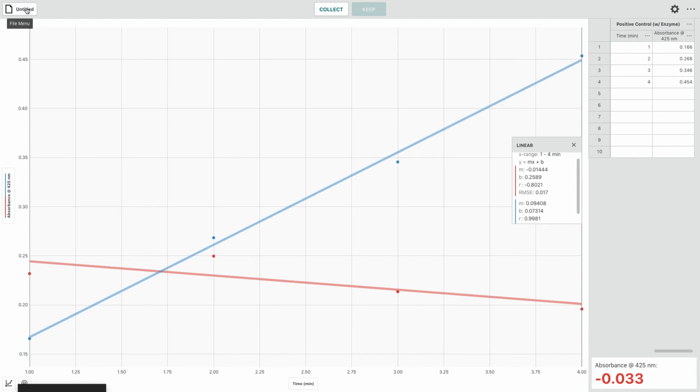But as always, if you have any questions, don't hesitate to ask. One last thing before I forget. Probably going to want to save these data before you get too carried away. So in the upper left-hand corner, press that button, select save. You can give the file a name. Since you're working on a device that is not your own, you're probably then going to want to take that file and upload it to your own Google Drive.